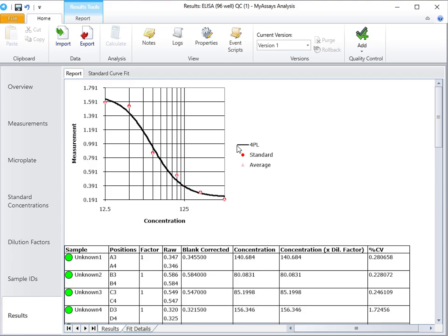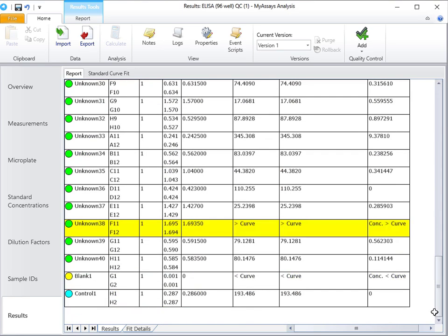that a single plate has been analyzed with a control sample in wells H1 and H2. I'd like to create a control chart to display the results of Control 1 with a concentration target mean of 180 and a specified standard deviation of 18. As part of my QC requirements, the 3 most recent observations must have a mean greater than 150, so I'd like to add an evaluation to report the mean of the 3 most recent observations and a rule specifying the mean of these observations is greater than 150.